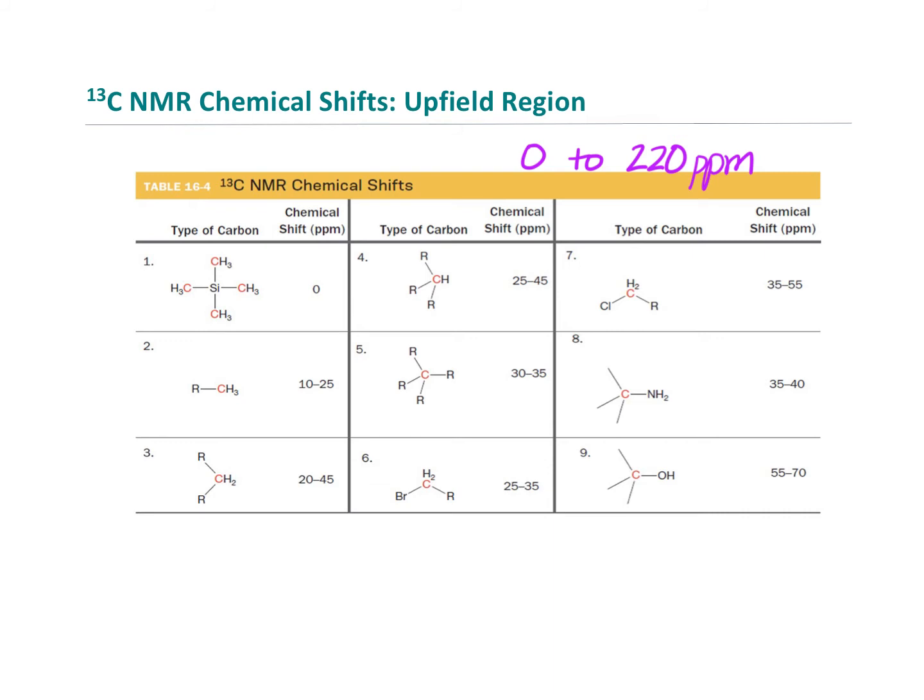Now, despite the different values for the proton and carbon-13 chemical shifts, the order of the functional groups for carbon-13 chemical shifts is roughly in the same order as the proton NMR chemical shifts. So you're going to find, as we mentioned before, the C of the CH3 is going to be lower, right, for that sp3 carbon than for an sp2 carbon than for an sp carbon. So these go in roughly the same order.